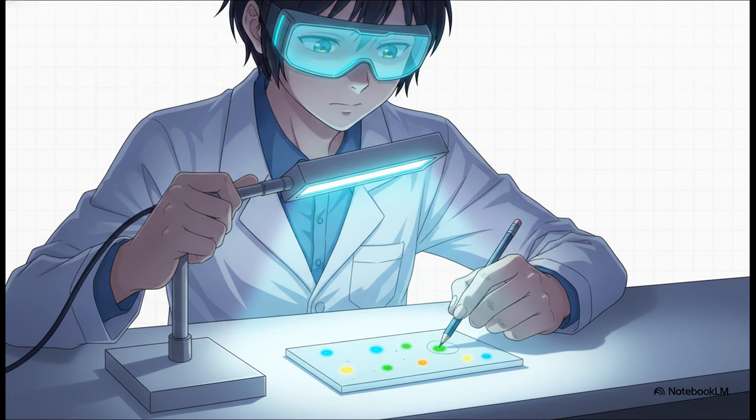While looking under the UV light, we take our pencil and carefully circle the final resting spots of our samples. Oh, and a quick safety reminder here. UV light can really damage your eyes, so always wear protective eyewear when you're operating these lamps.